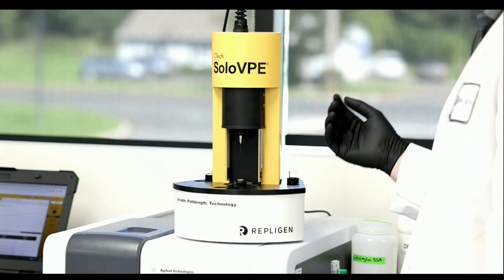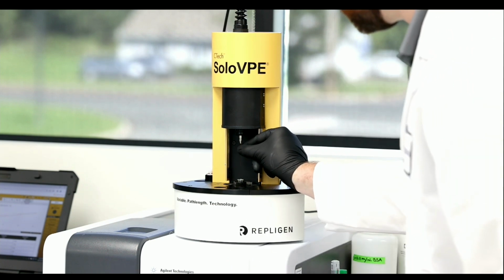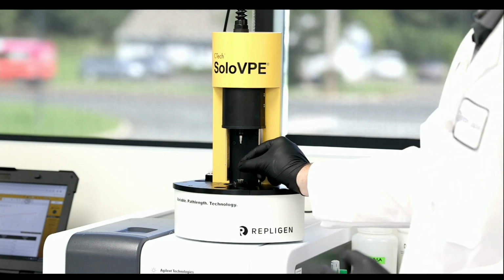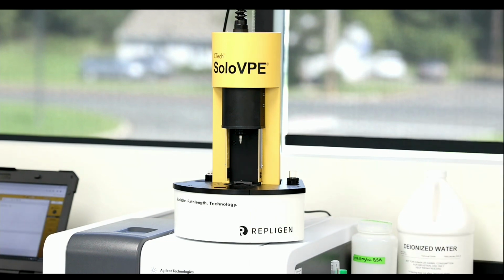So one good tip here is anyone that in the future gets a SoloVPE, when you take the fibrette out, just make sure you leave the sample in there so that in case the fibrette goes back to the bottom, it actually just went inside the sample container and you won't touch the glass below. So we'll remove this.